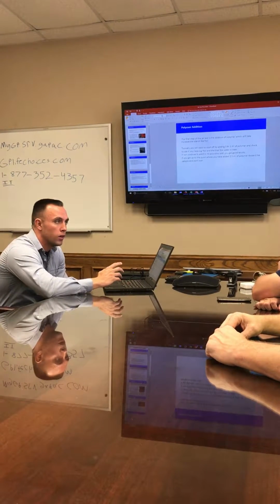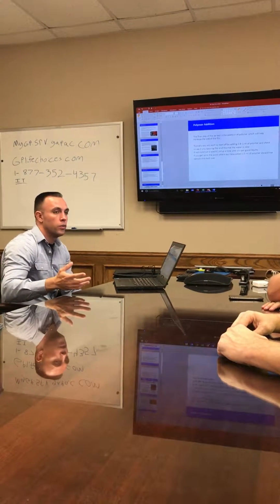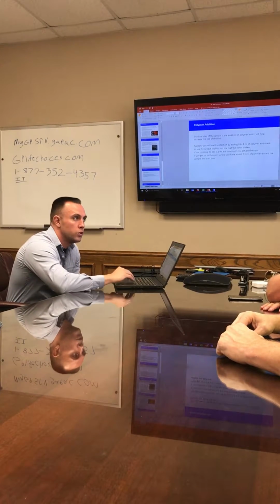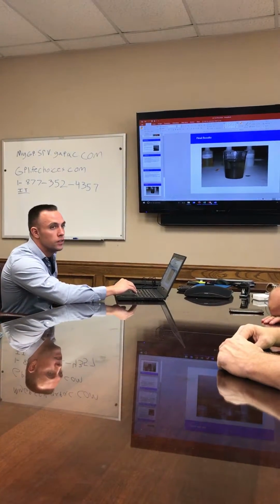I've seen it before where I've added like 2 milliliters, and then I did another sample and it only took like 1.5 and it was fine. So for whatever reason, just sometimes you have to do 2 jar tests to get it good. And then this is what your final results will look like. I'm sure you've all seen that.